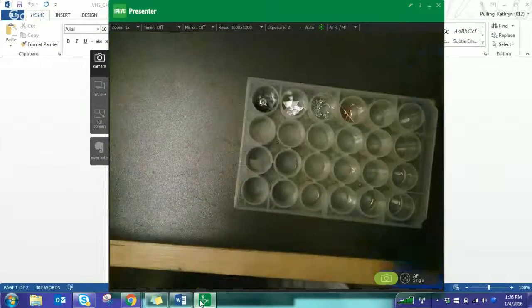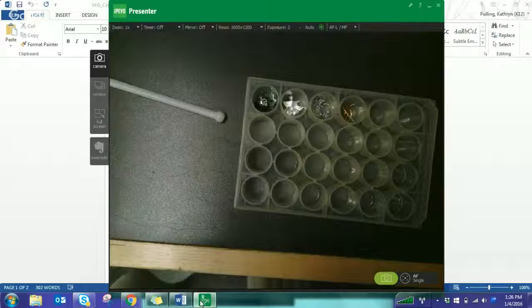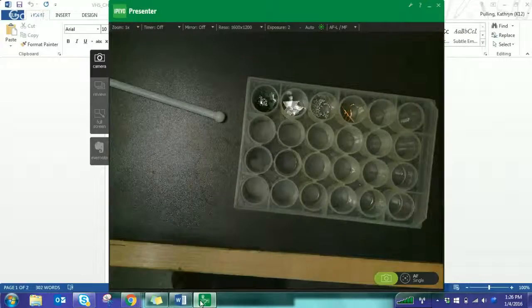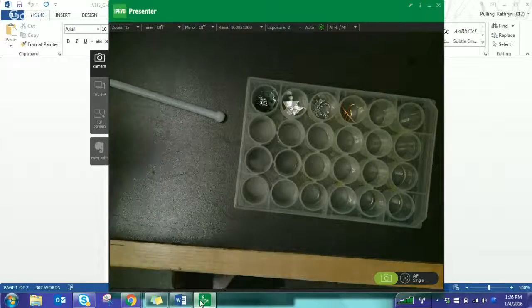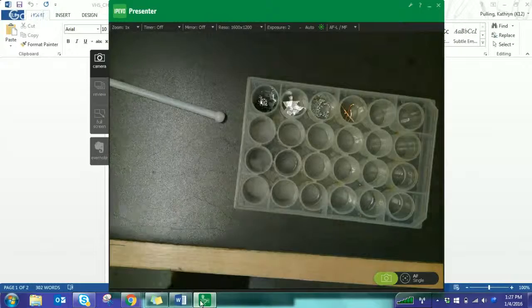And I'm actually going to continue using this well plate as we go on to part 3. Part 3 is a lot like the last lab that we did. You're taking 2 liquids and combining them together to see if you get any sort of reaction.